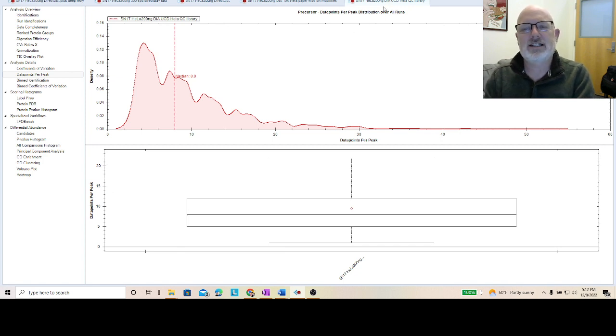So anyway, that's the data for our 3-minute runs. 3-minute runs are pretty inexpensive. I mean, they're virtually free. If you have 300 samples, you can send them to me. We can run them all in a day. There is some overhead. The Evosep tips cost around $3 a tip. But other than that, we can load up 300 samples in a day. Let's do it. Someone should send me 300 samples and we'll run them and we'll see what we get.